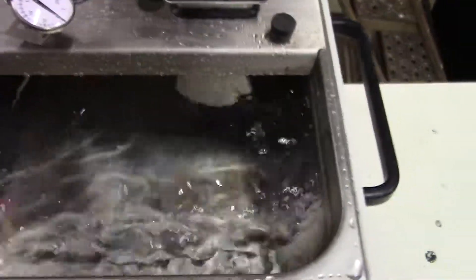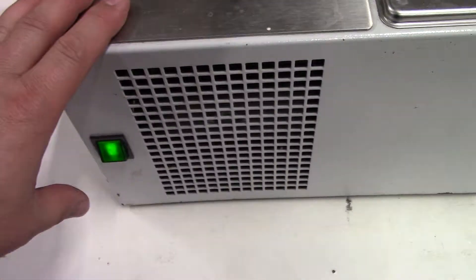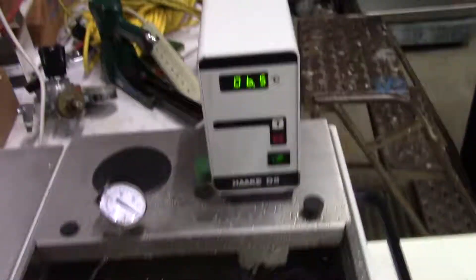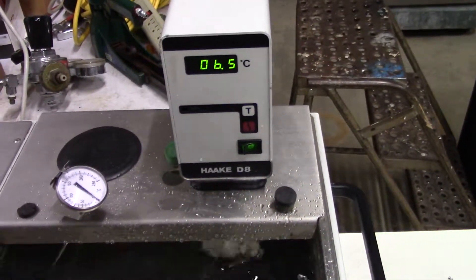What makes this a little bit different than a regular recirculating bath — and I'll show you — it actually has a chiller component to it on the side. The pressure is over here. We're holding a nice temperature of 6.5 degrees Celsius.